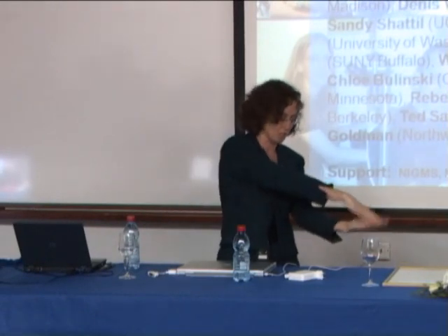So the microtubules are not cortical, but the actin cytoskeleton, if you do a 3D reconstruction of it by light microscopy and look at it from the side, it looks like this. There's no actin in the middle of the cell. It's just underneath the plasma membrane. Microtubules, though, do fill the center of the cell where all the organelles are bound to them. So we do miss a lot of information there.